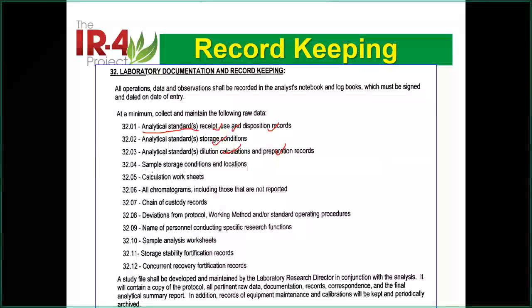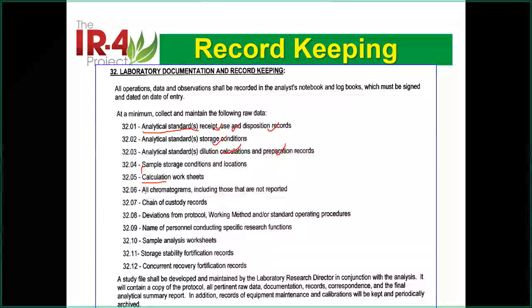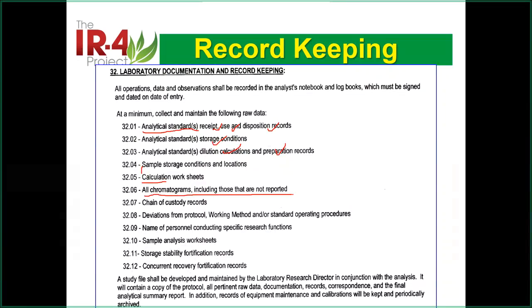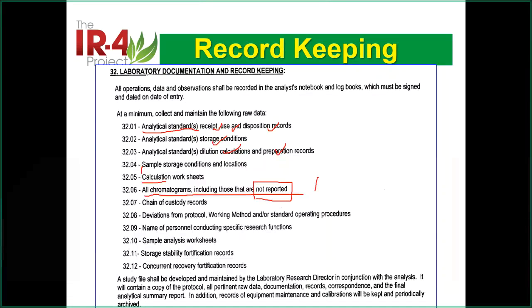Then about the same thing for sample, for calibration. I don't need to say everything, but these are the key points in every single chromatogram. You need to have it there, even though it's not reported. Even though you say it's not used.